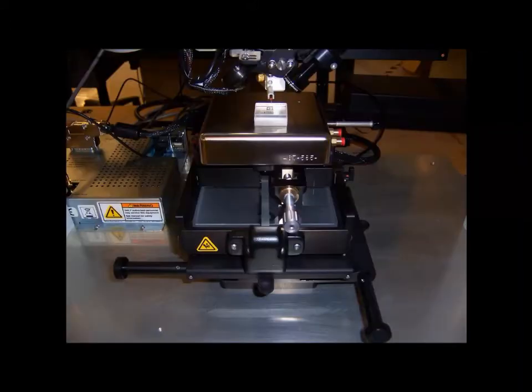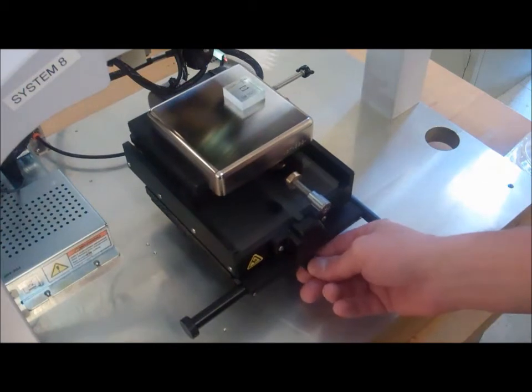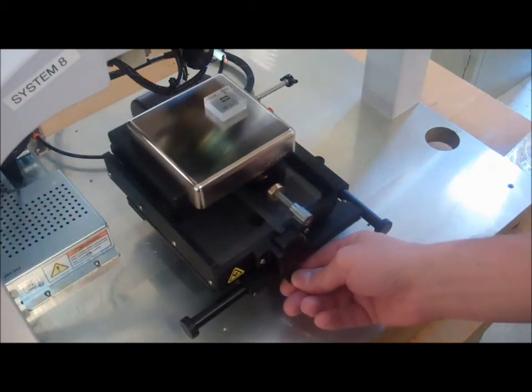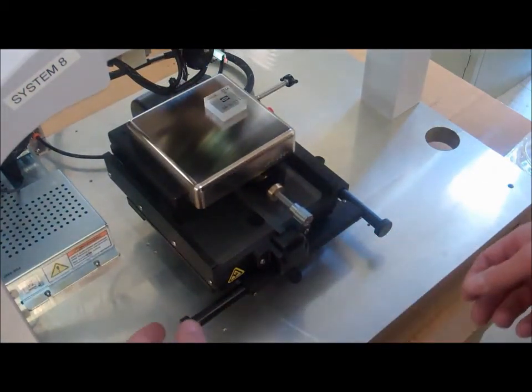The standard DECTAC XT configuration includes a 100 mm manual XY positioning stage. The clips allow for macro sample adjustment, while the knobs provide for finer adjustments.